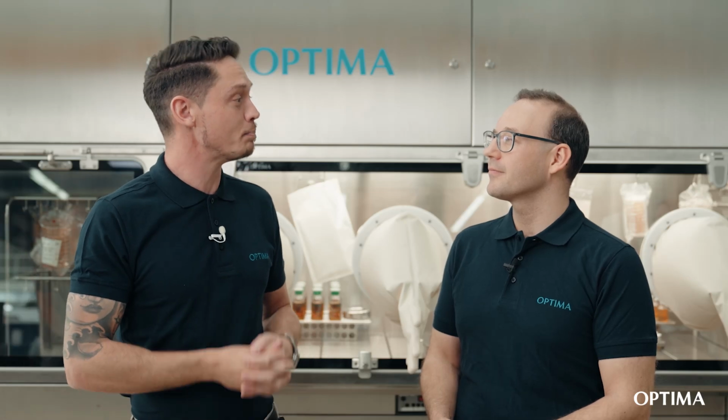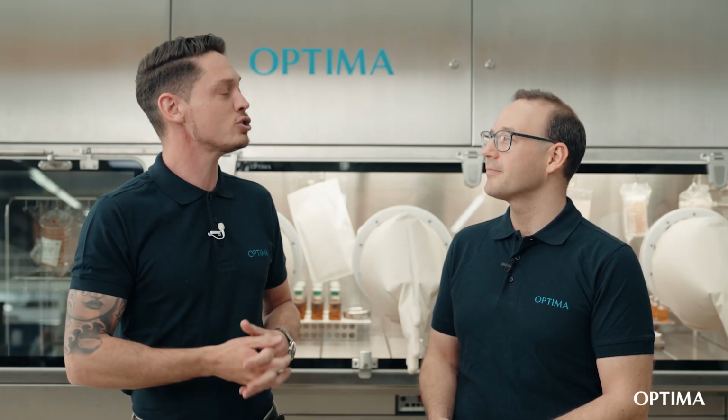Today we are talking about biodecontamination. Why is it so important? Actually, it's the prerequisite for your production in the isolator. You want to handle aseptic processes and you want to get rid of your microorganisms inside.